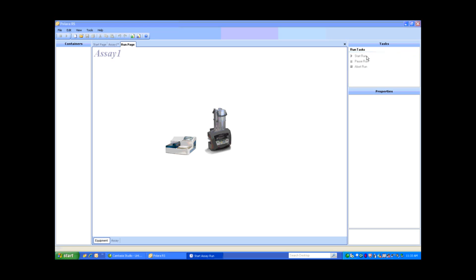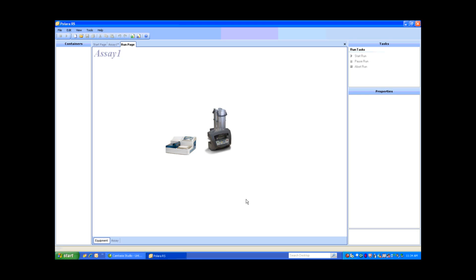That's all I'm going to do. Now I'm going to go to the top right and run this assay. My source plates are at the front of the RapidStack and my empty plates are at the back — so this setup is perfect. I'd like to restack my plates at the end of the run, which means it will transfer them from the empty stack back to the source stack. All I have to do now is hit Start Now.